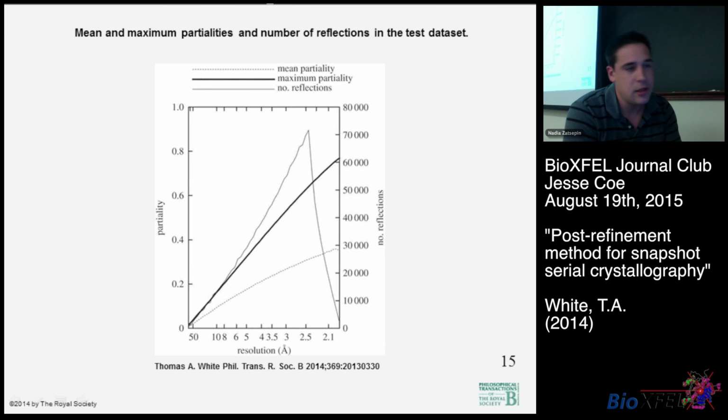And this makes sense if you think about the fact that you'll be farther away from where the Ewald spheres are all near each other, and your intensity measurements are going to be much lower than if you had been kind of near the center.